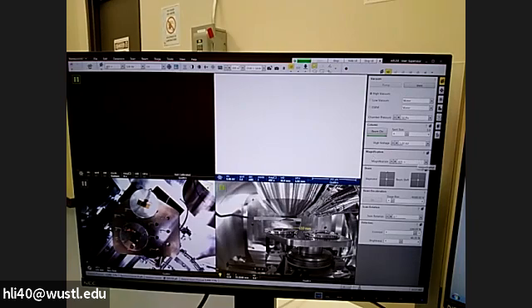Click on it. We have magnification, a beam, stigmator, and a beam shift. At the start of a session, it's good to check and make sure the beam shift is in the middle. If not, just right click on the mouse and select 0. The next is the stage bias.